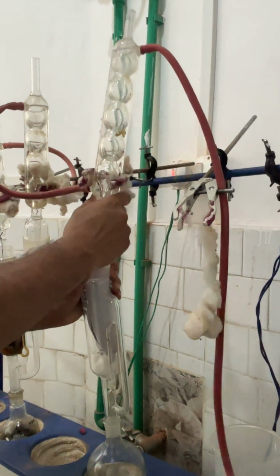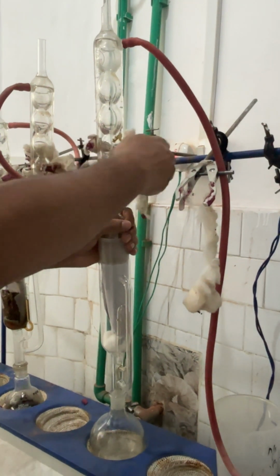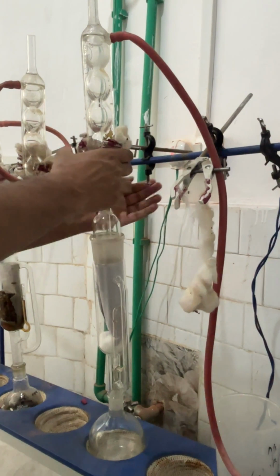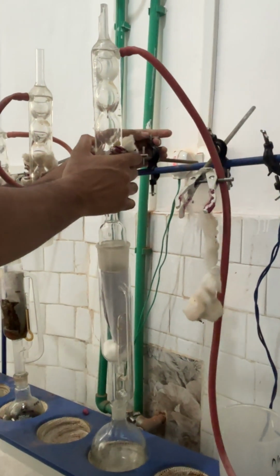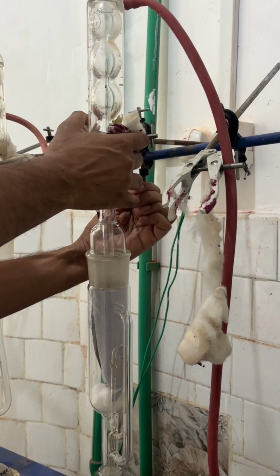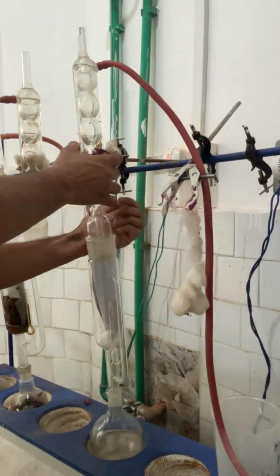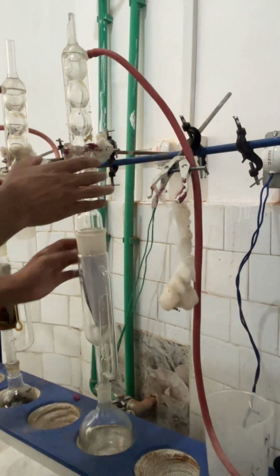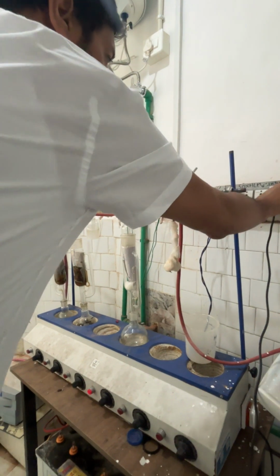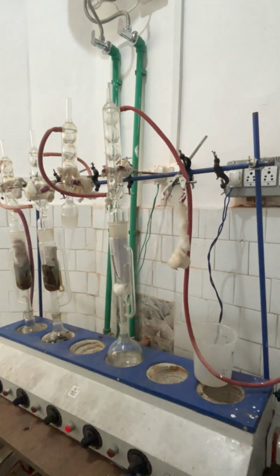So you have to be careful. I'm going to break it. So now straight, right, and now we'll plug this on. Okay, and it's working, but now we need a solvent.